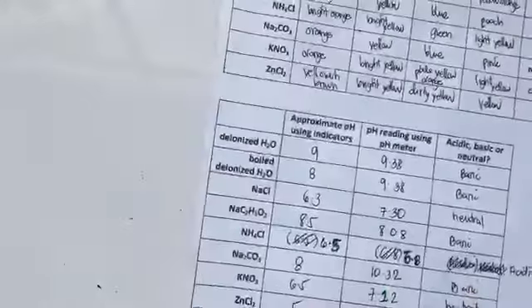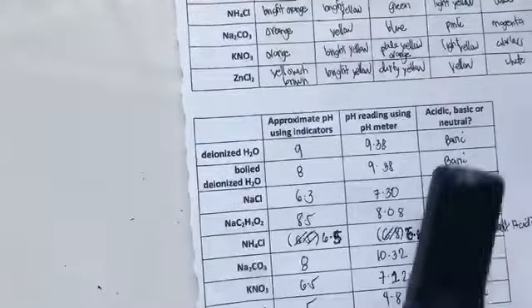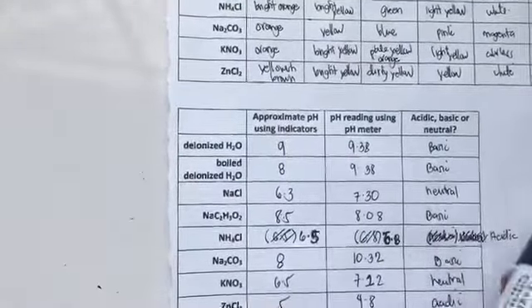The third question is why it is necessary to boil the distilled water in the experiment. It is necessary because unboiled distilled water is relatively acidic. So if you boil the distilled water, it will no longer be acidic, because acidic distilled water can somewhat affect the pH of the salts being analyzed. As you can see here, our boiled deionized H2O is basic and our deionized H2O is also basic.